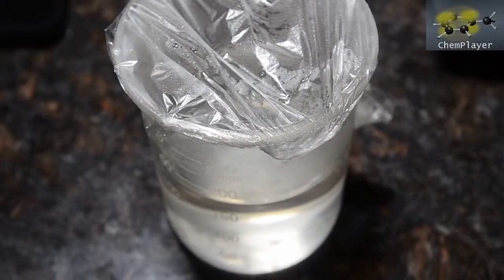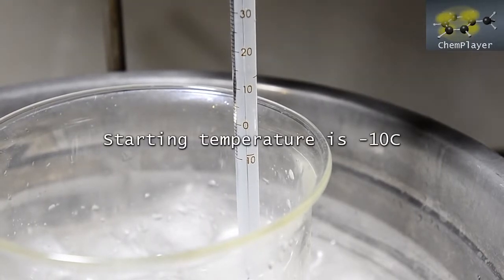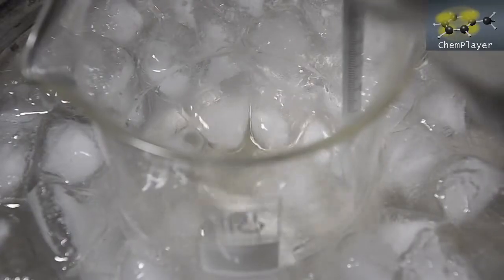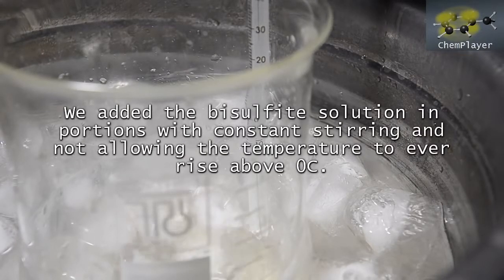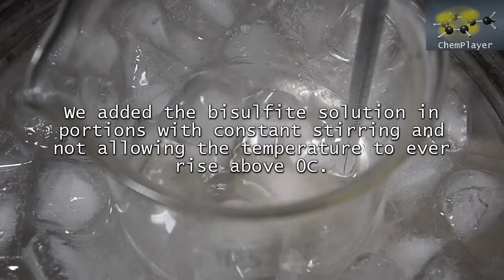And now our chilled bisulfite solution. Temperature of the mixture is at -10 degrees. So we'll add the first small portion of bisulfite. We added the bisulfite solution in portions with stirring, and not allowing the reaction mixture temperature to rise above 0 degrees C.